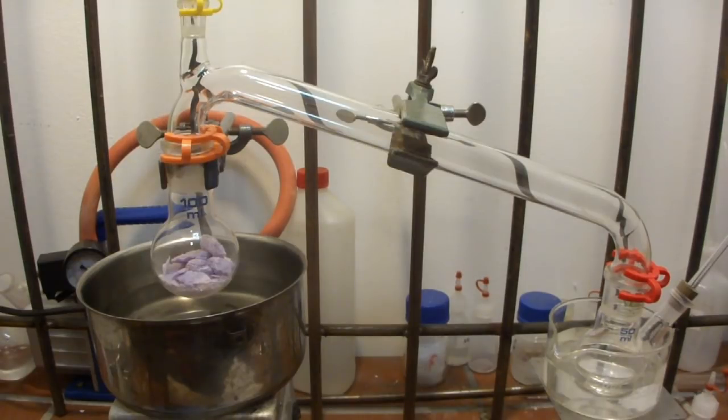So for this fuel bar we have found that it contains more than 89% of trioxane, a few percent or so of magnesium stearate, which is just a fatty acid, and some methylene blue to give it that bluish color that you can see right here.